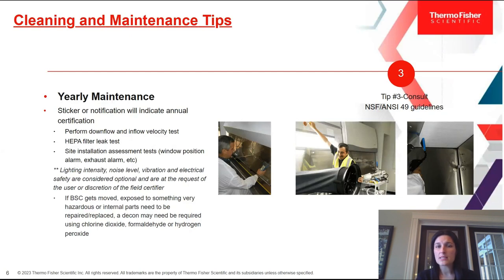Lastly, if a BSC gets moved, gets exposed to something very hazardous, or internal parts need to be examined — such as opening the plenum to check the filter or motor — a decontamination will probably need to be done by the certifier using either chlorine dioxide, formaldehyde, or hydrogen peroxide.